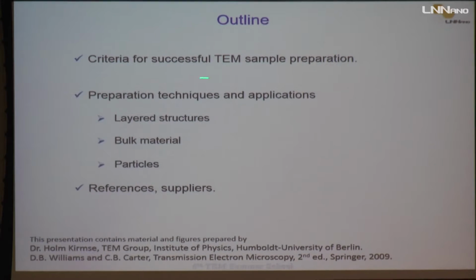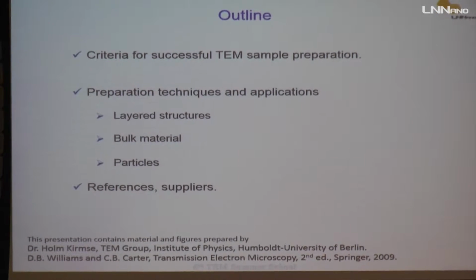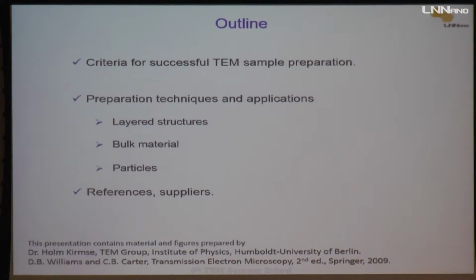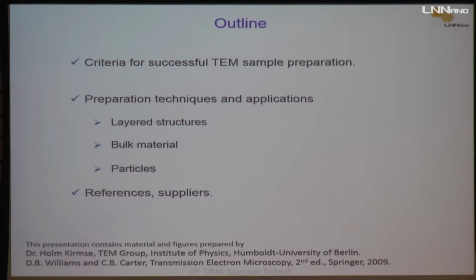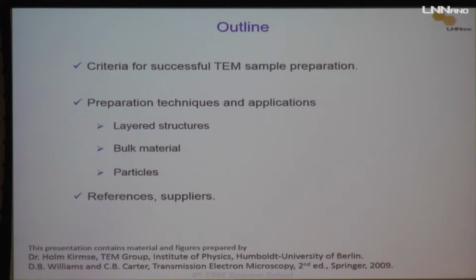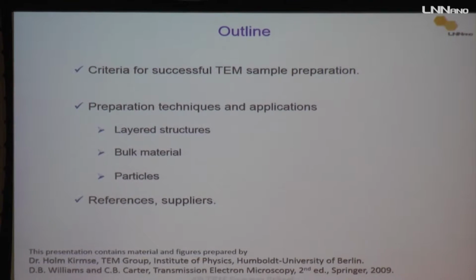Okay? The outline of my presentation is this. I will discuss first the criteria for successful TEM sample preparation, and then I will go to the description of some techniques. I will put some examples. They are very limited by the possibilities that I have to present here, but you have plenty of opportunities in working on your samples.